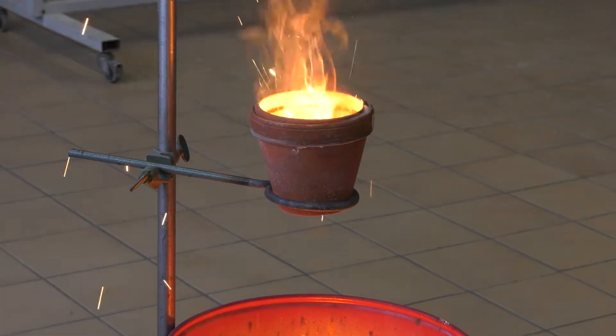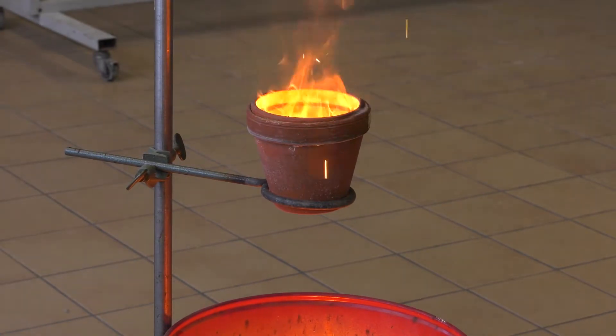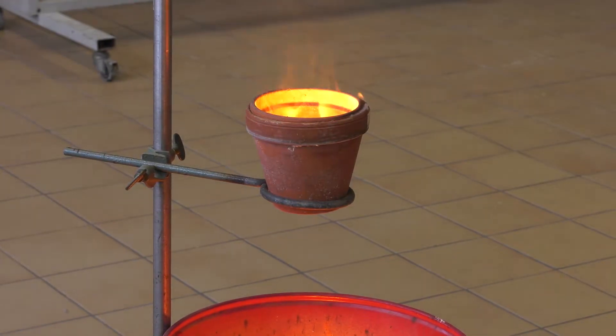Thermite produces a strong exothermic reaction whose heat can go up to 2,500 degrees Celsius.